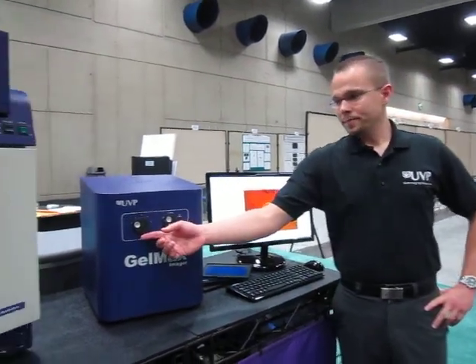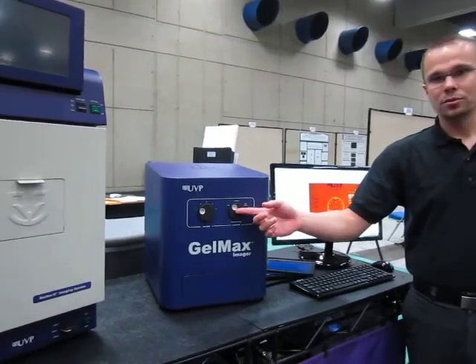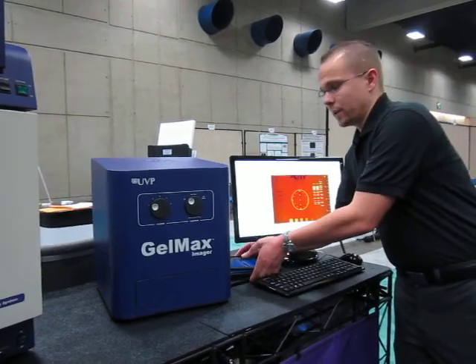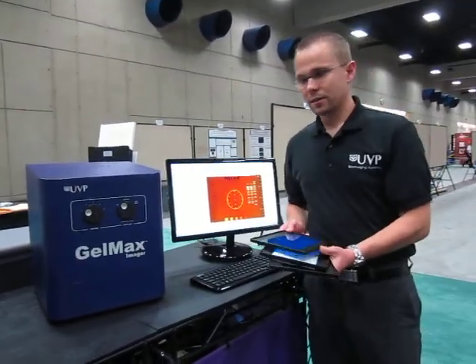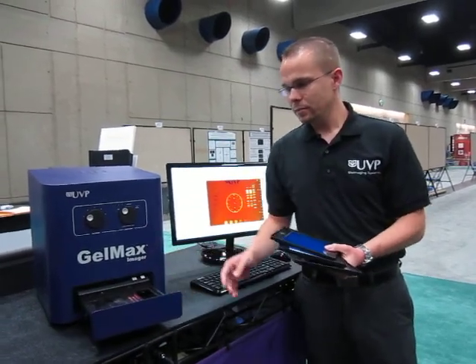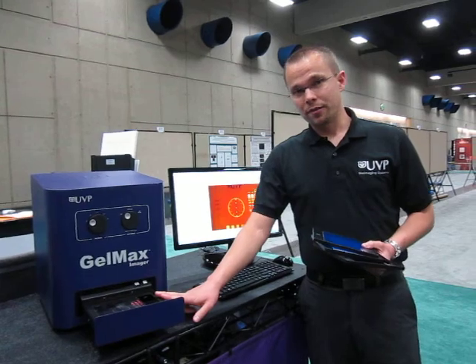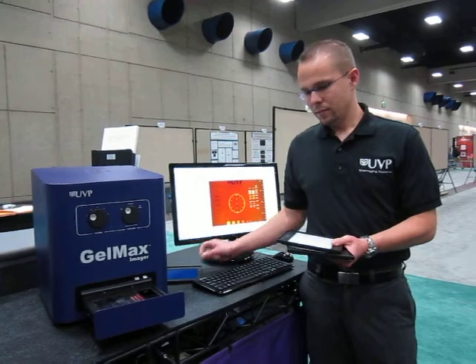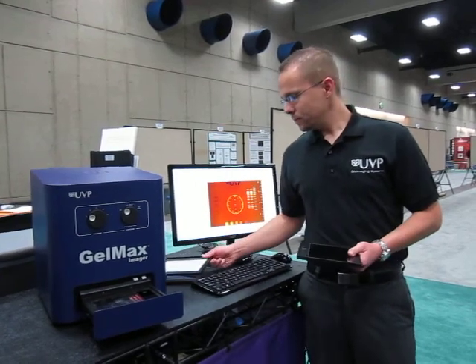The GelMax Imager is a simple all-in-one system for imaging mini and precast gels. The system integrates a five-position emission filter wheel, a UV transilluminator, as well as epi overhead white lighting. The system also comes with a variety of converter plates that can be placed on top of the transilluminator within the system. It comes standard with 302 nanometer UV, which can be converted to 460-470 nanometer blue light, white light, or long-wave 365 nanometer UV.